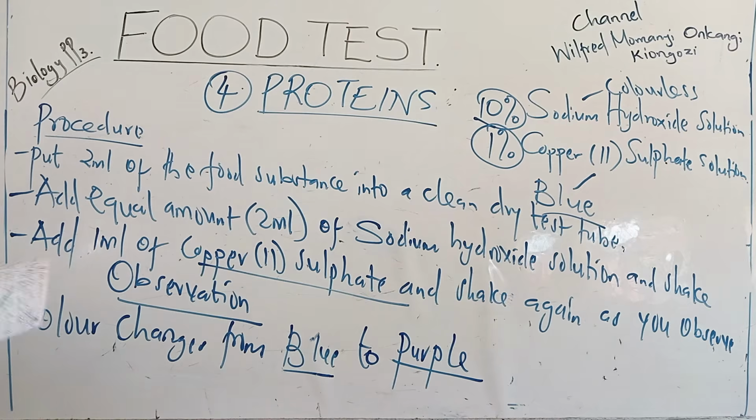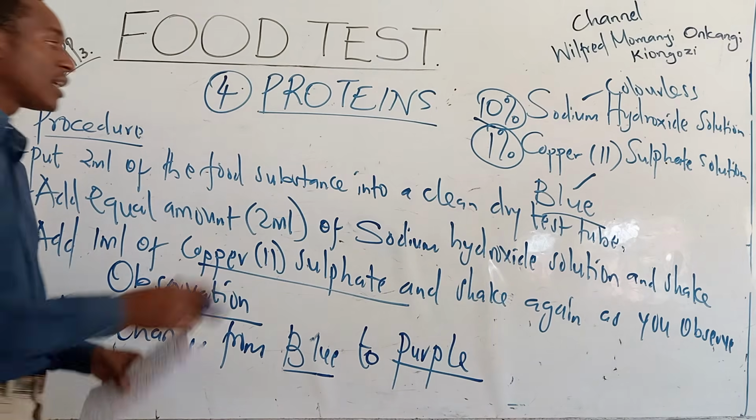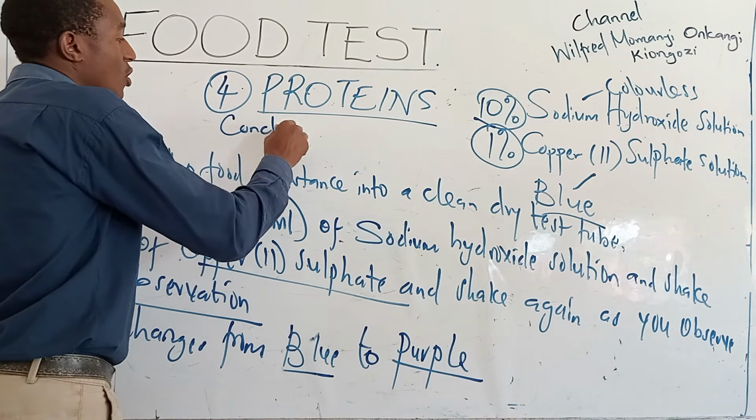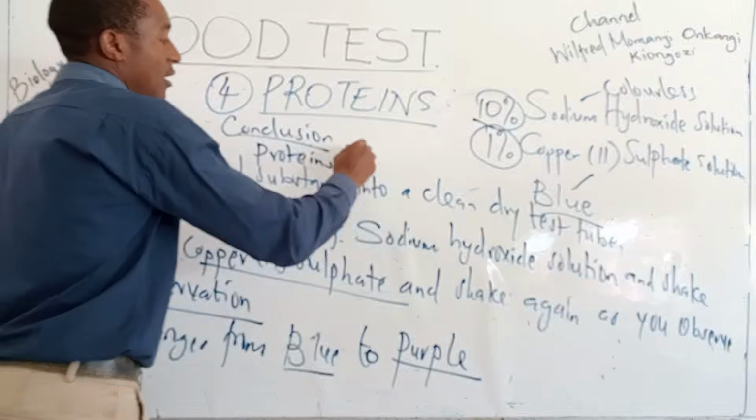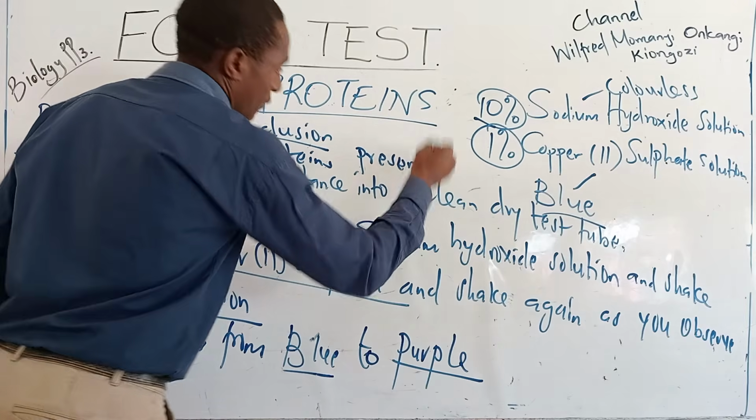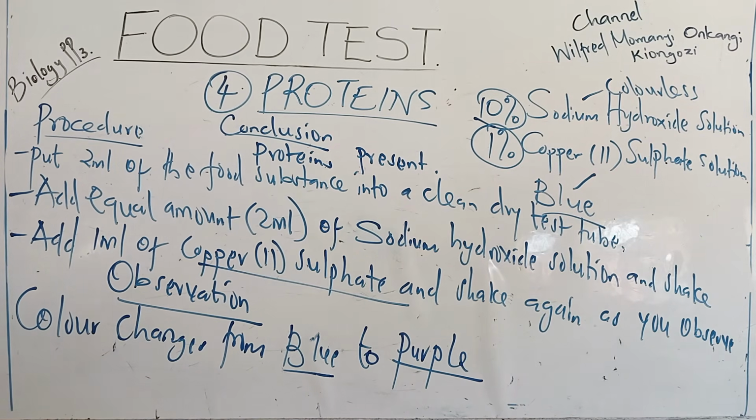Blue to purple. And then that means in the conclusion, proteins present. That is all about the proteins.